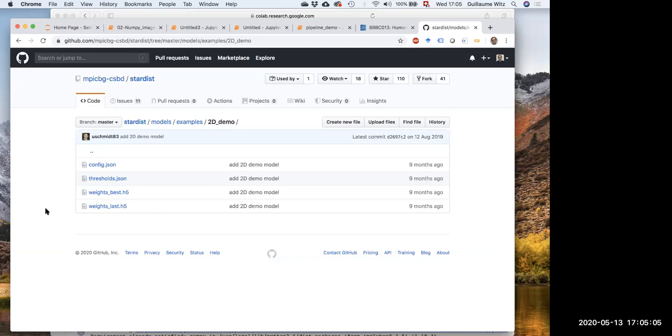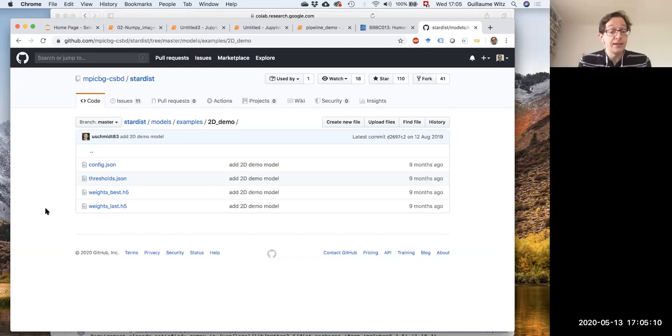But the question, I think, was rather about the availability of the training data. For the training data for cellpose, if you go and read the bioRxiv paper, they tell you exactly where the data are coming from. I think most of them are from a competition, I don't remember what it was called now, where people competed proposing deep learning approaches for segmentation of nuclei. This was also led by the CellProfiler people. So they used this, I think, and added other sources of data, and everything is public. If you read the paper, you will find all the sources of those data.